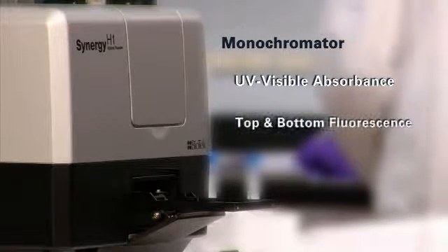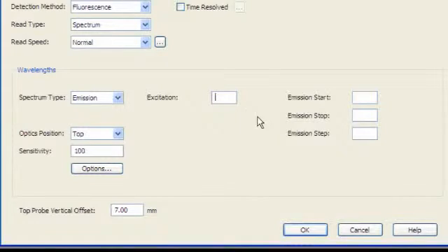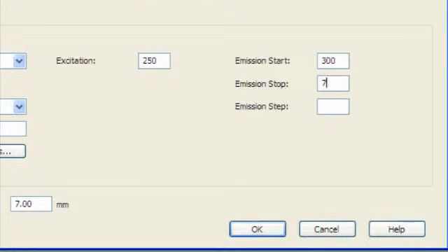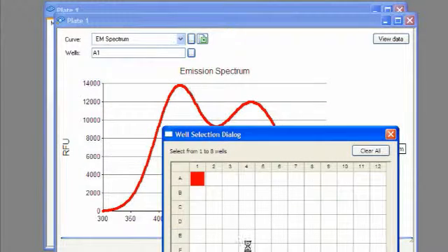The monochrometer-based module supports UV visible absorbance, top and bottom fluorescence, and luminescence. Any wavelength from the low UV to the near infrared can be selected through the software, making this system extremely flexible and easy to use for a wide range of assays. Unknown samples can be scanned to establish excitation or emission maxima.